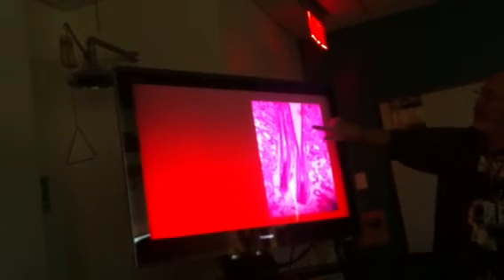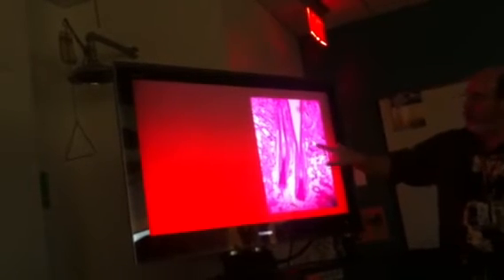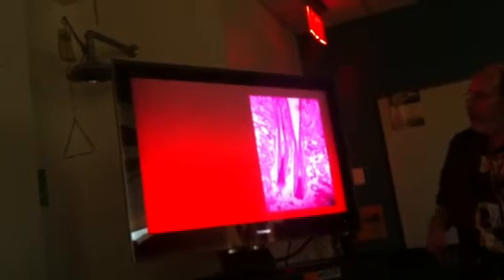For our purposes, sebaceous glands are stratified cuboidal epithelium. You can see that pretty clearly, and they are associated with hair follicles. These are the sweat glands down here, which are simple cuboidal epithelium. If you get way down to the base of a sweat gland, you might see it get a little stratified at the very bottom, but for the most part, they're simple cuboidal tubules. I think I have better pictures.